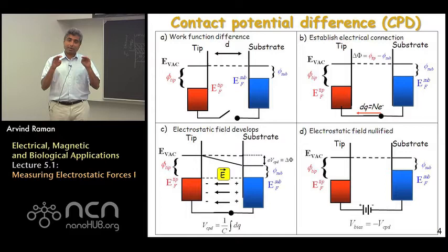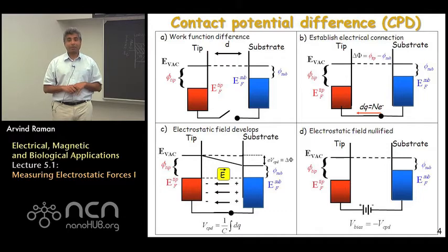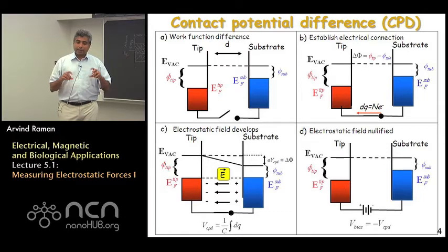The other important thing to keep in mind in the panel on the top left is we're talking about a reference energy level, which is going to be the E vacuum, EVAC, and the energy levels of the Fermi level and below are shown on this graph, all relative to the EVAC. Now, EVAC is effectively the energy level at which the electron can be considered as being dissociated with the solid and free in space, obeying the laws of particle mechanics with certain charges. Whereas when the energy is below EVAC, it can be considered as being associated in some way with the solids and being governed by the laws of quantum mechanics.